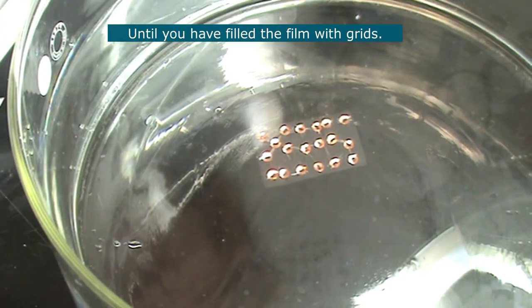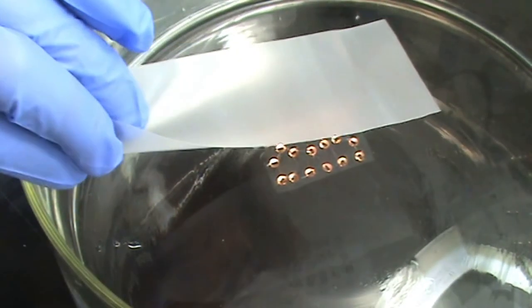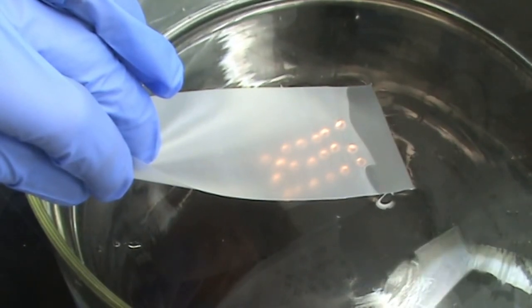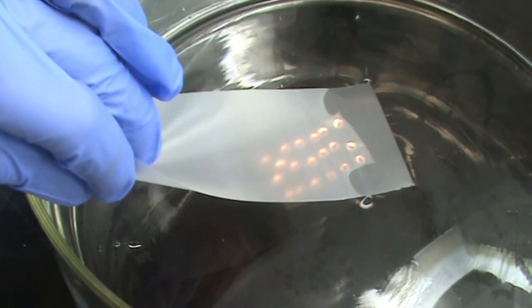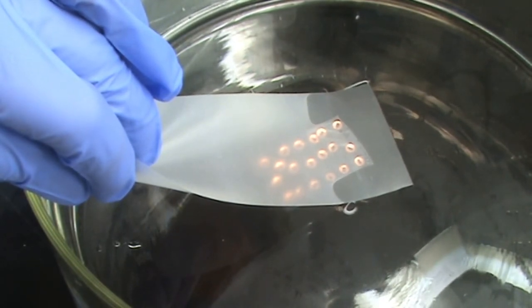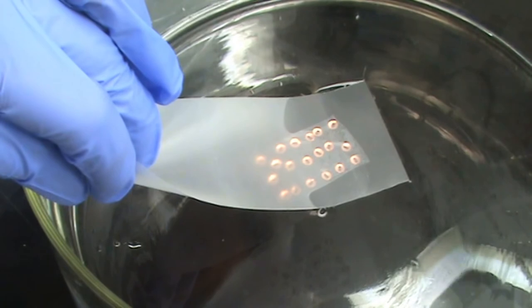Once you have a formvar film full of grids, use a piece of parafilm to collect the formvar. Lower the parafilm against one side of the formvar film slowly. Then slowly allow the formvar film to stick to the parafilm as you lower the parafilm down onto the water.